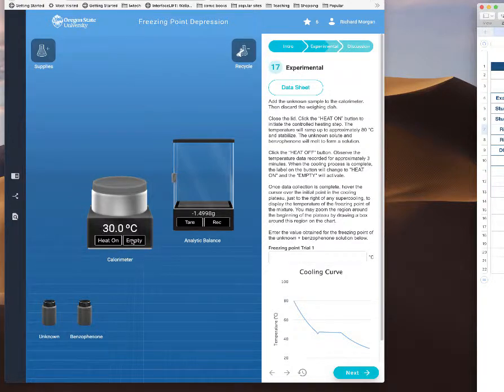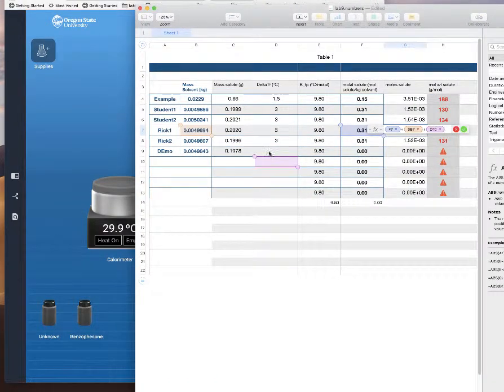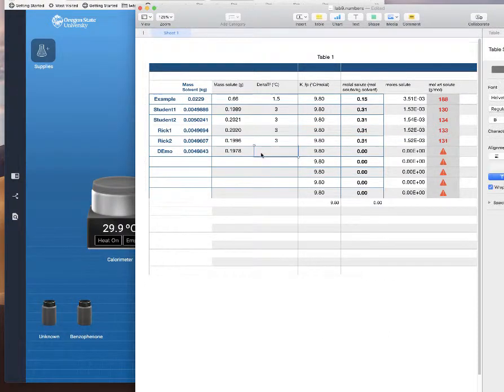So there we go. You should empty this when you're all done. But let's take a look here and see what the freezing point is now. I'm going to say it's 47.1, I'd say. So 47.1, and if before it was 50, that means that the freezing point depression was 2.9 degrees. So I'm going to write that here. So, whoops, that's familiar. So that's 2.9 degrees.